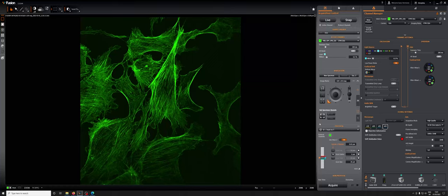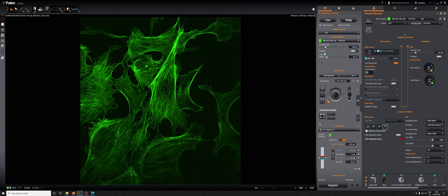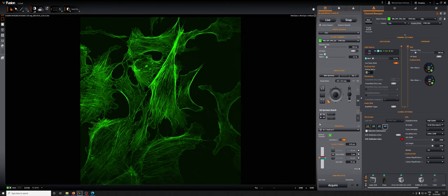I'd like to discuss now how we can increase the magnification in an image without changing the objective. This system has in front of each of its two cameras a magnification lens which by default is set to 1x but which can be increased to 1.5x. Let's see how to do that and what the consequences of doing that are.